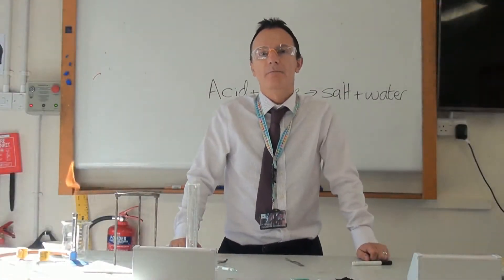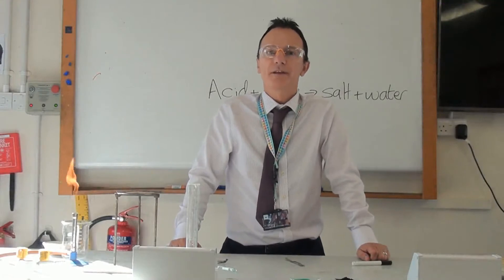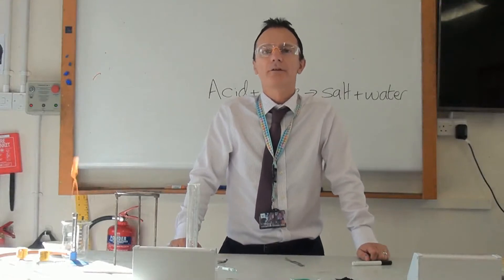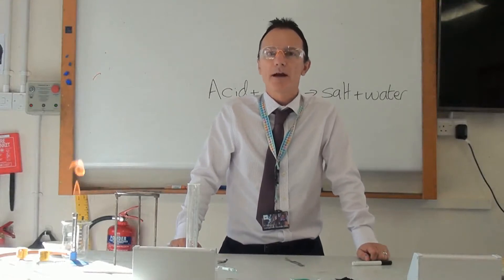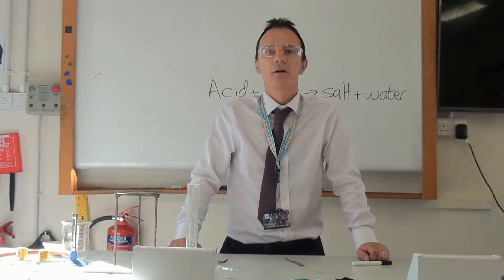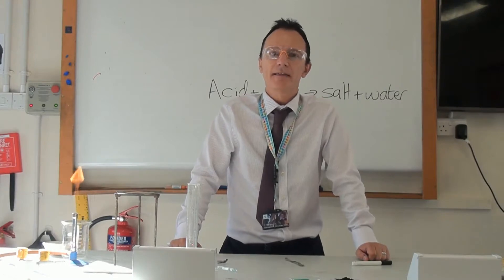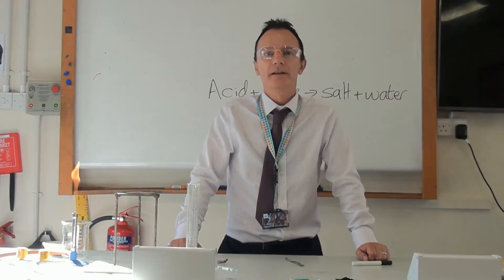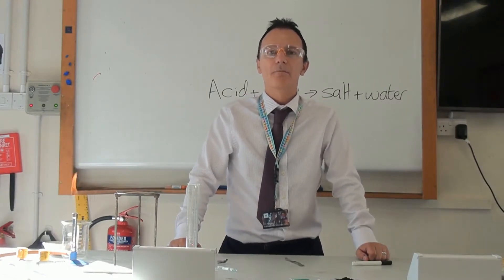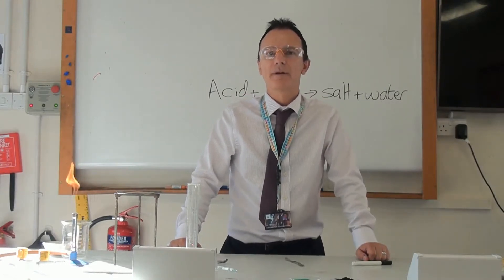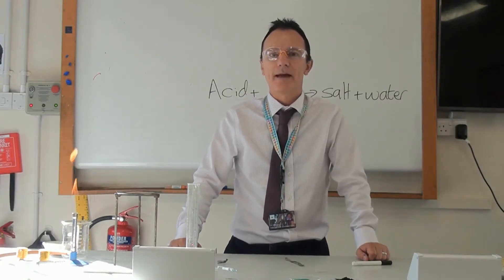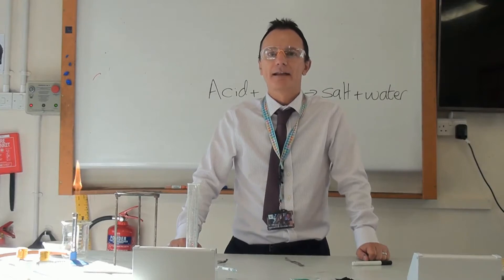Hello everyone. In this video we are going to do the required practical for C5 chemical changes. In that practical you need to know how to make a salt from an insoluble base and an acid.